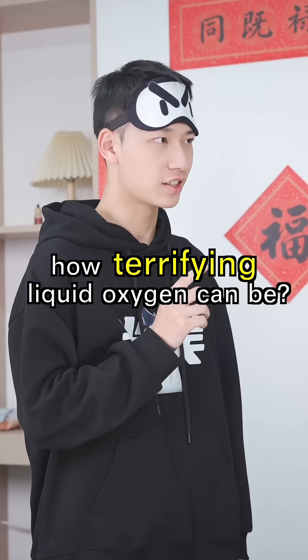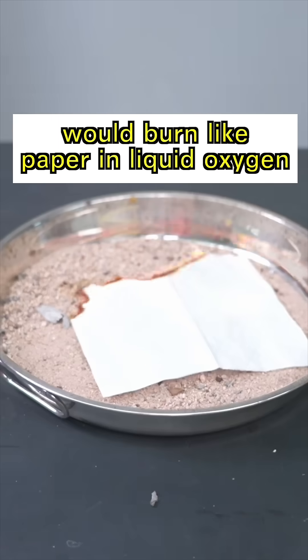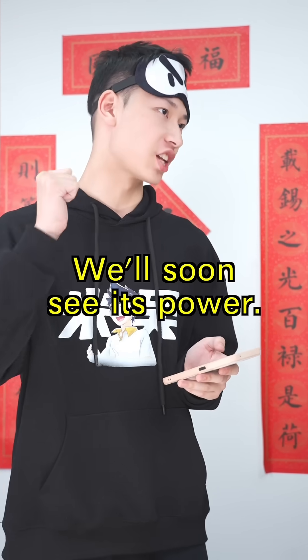How about witnessing how terrifying liquid oxygen can be? Liquid oxygen — terrifying? Even iron would burn like paper in liquid oxygen. Really? Liquid oxygen is right on the way. We'll soon see its power.